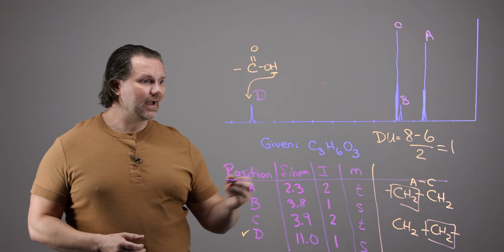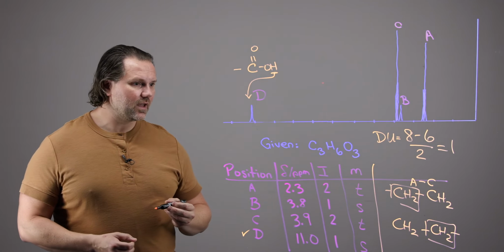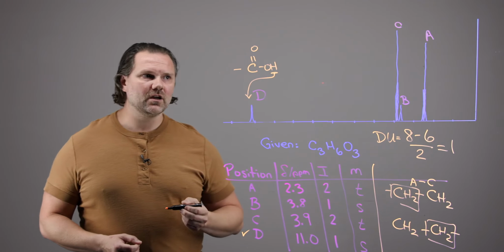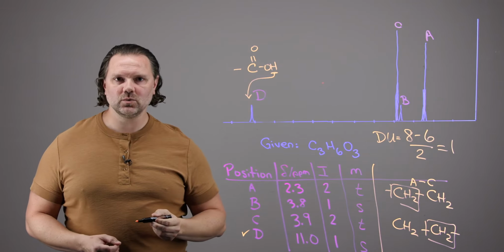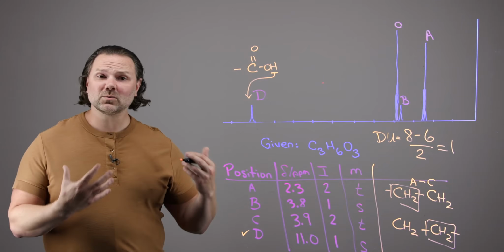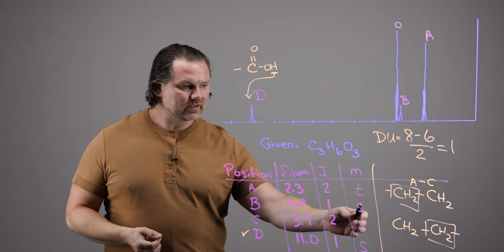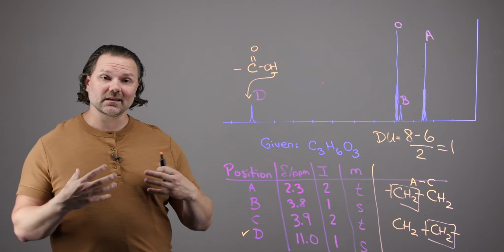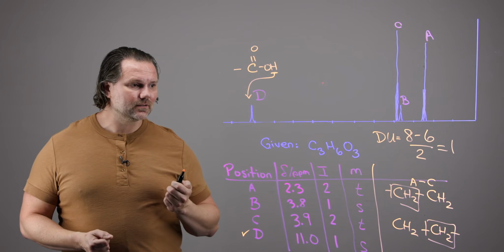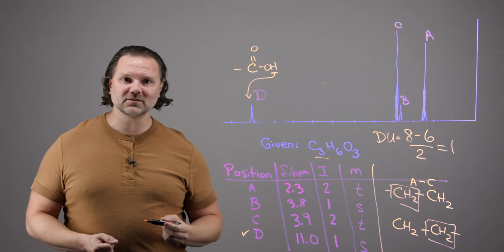But we have some additional atoms in the molecule we haven't accounted for. For example, we know there are 3 oxygens and we've only used 2 of them for the carboxylic acid. Okay, so we're thinking about what B might be, and while it's showing up as an integration of 1, that could be a CH group, we then paused and we were thinking about our chemical formula. We only have 3 carbons present.